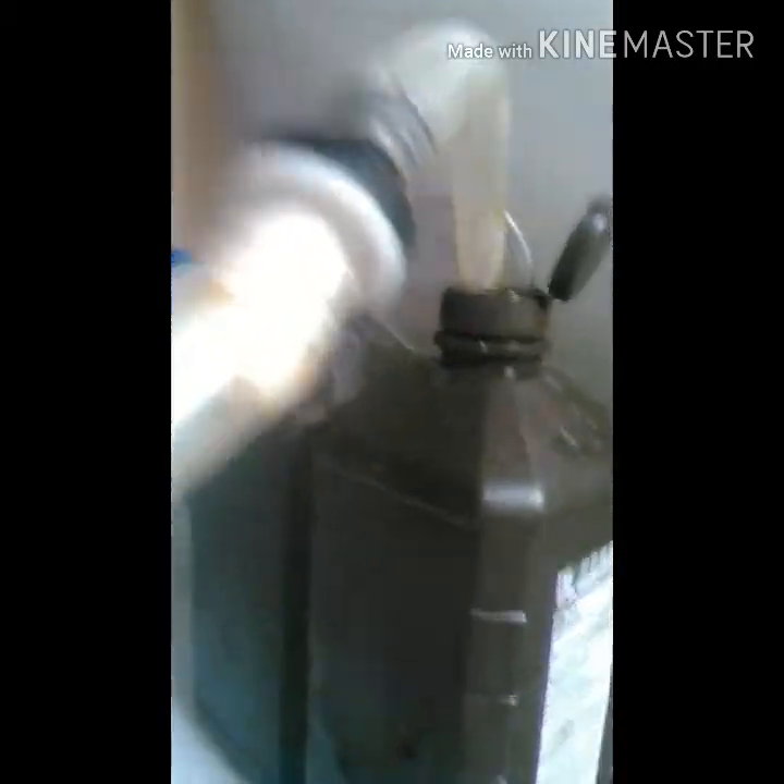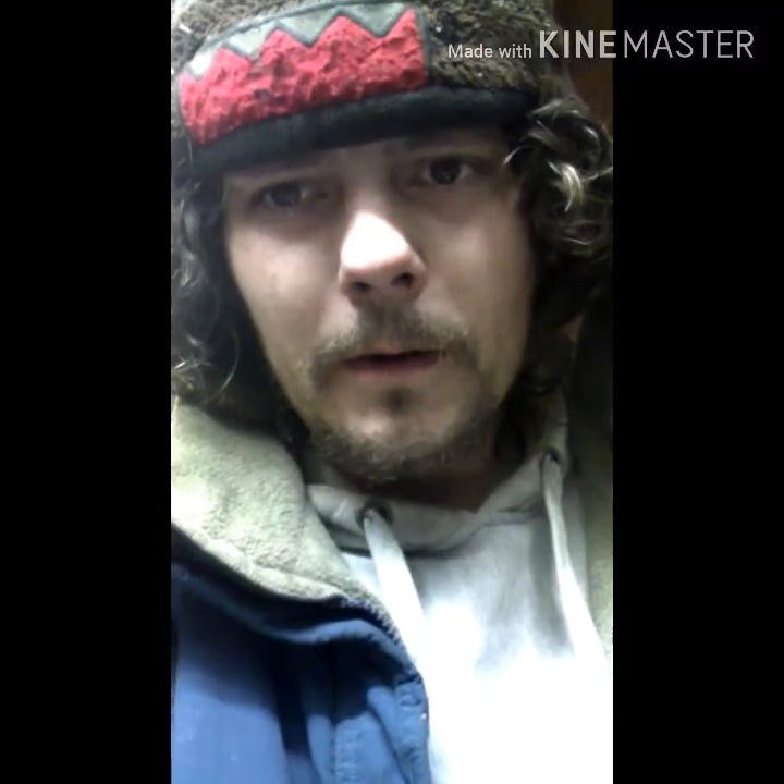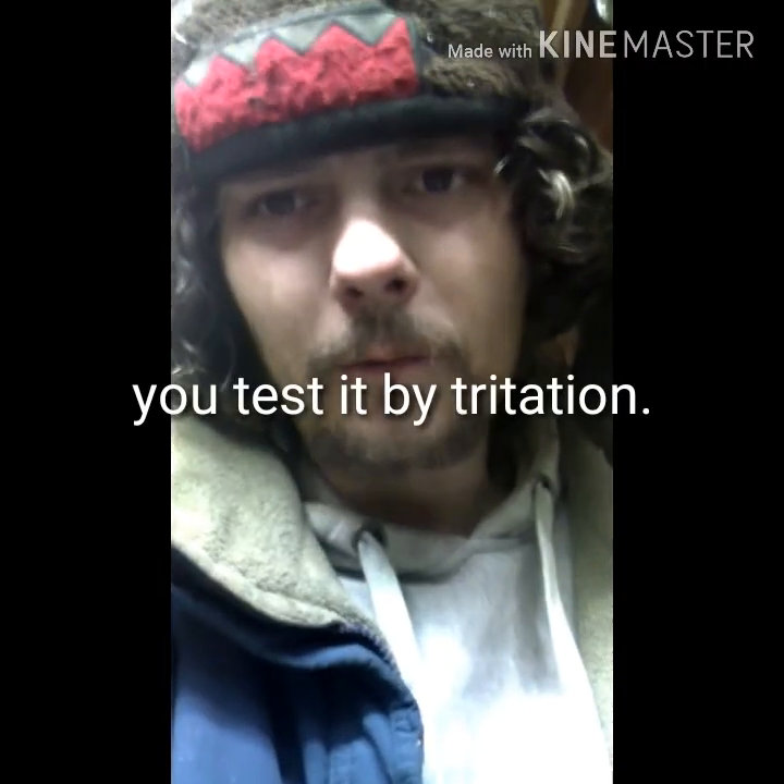I did put that check valve back in there, and it's still going. I don't have any way to test what percent of hydrochloric acid that makes. It'll make pretty concentrated acid the less water you have in your container that receives the gas bubbles. My two brown percolating containers are where the acid will be, and as a byproduct you get potassium sulfate.